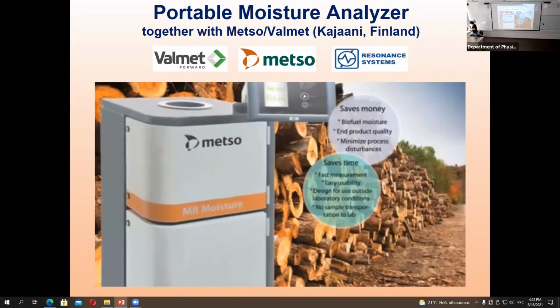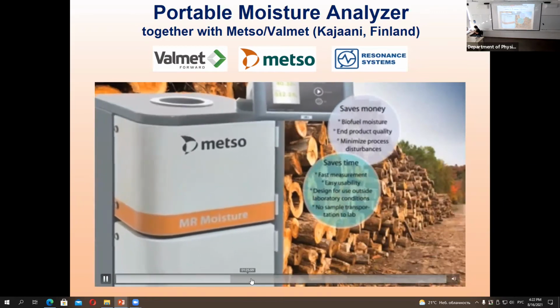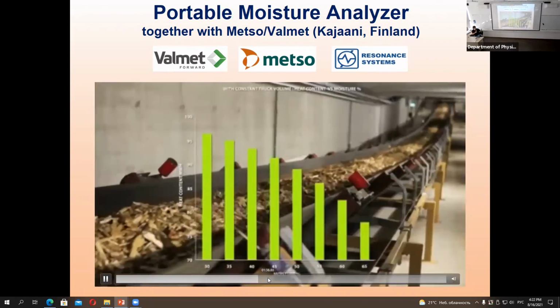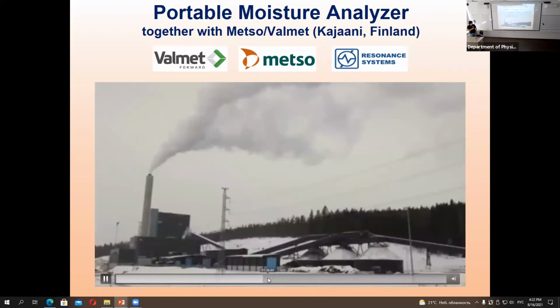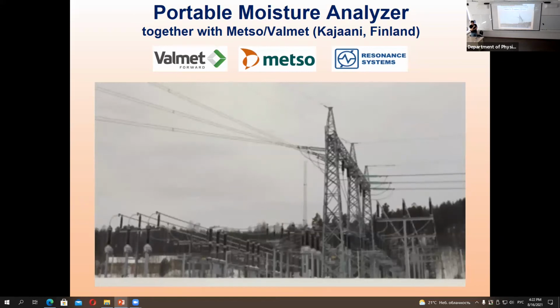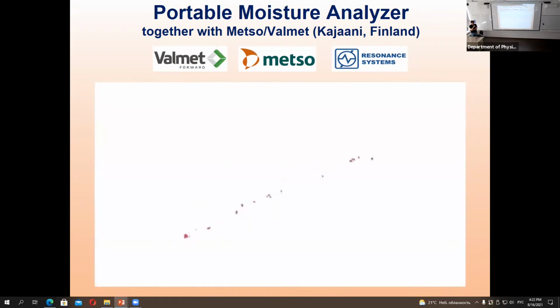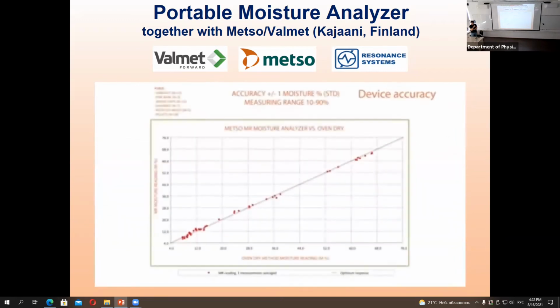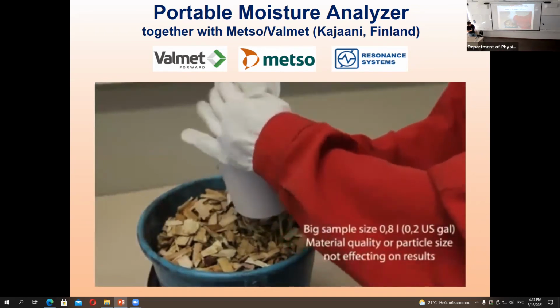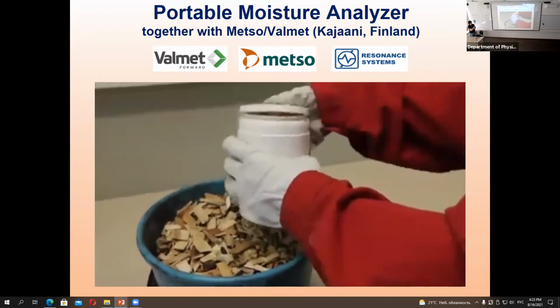Actually, we can look at it forever. Let me just see when we can. So the more water we have in a sample, the less typical picture. All these time-domain NMR instruments are actually sold to industry and they use them in day-to-day applications. Yes. And they're using our boards. This is what people need. Simple.